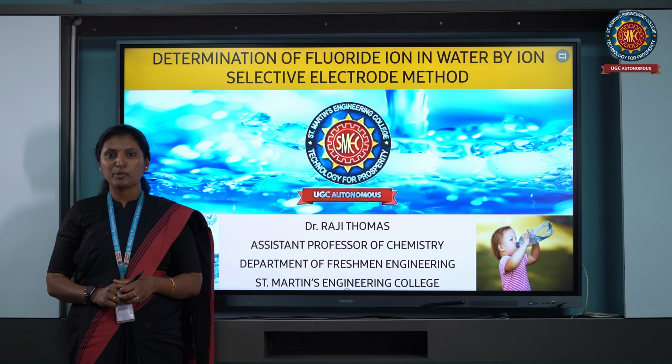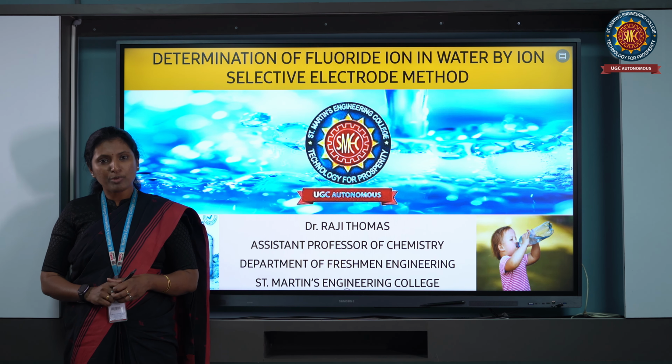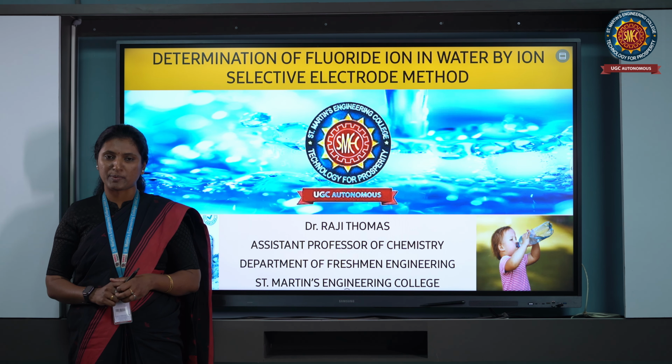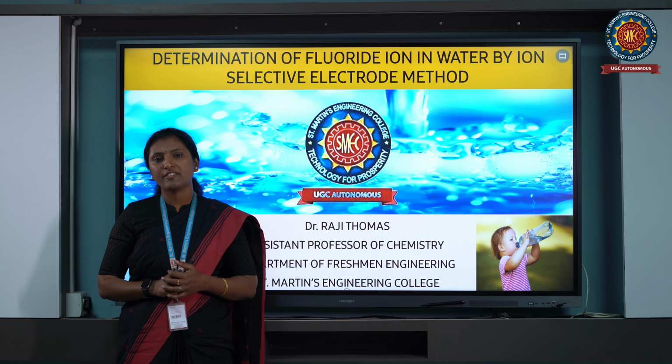Today I want to talk to you about the determination of fluoride ion concentration present in water by the ion selective electrode method. Before going to the details of this experiment, I want to talk to you about the significance or applications of this experiment. From this picture you can observe small babies drinking water.